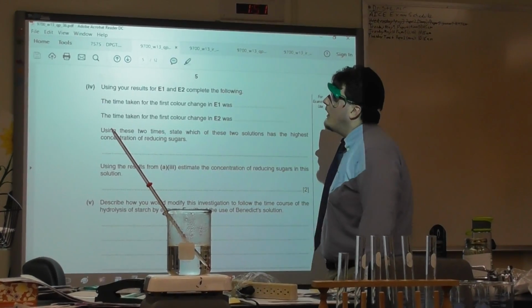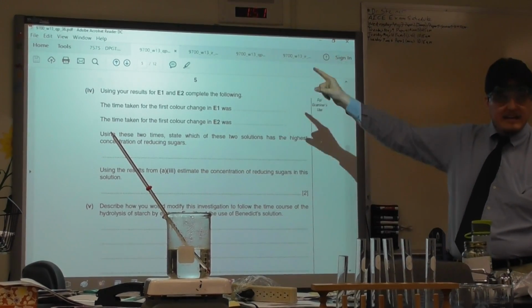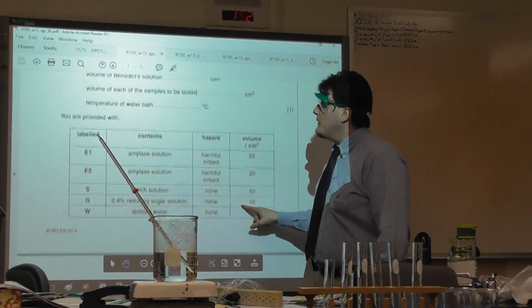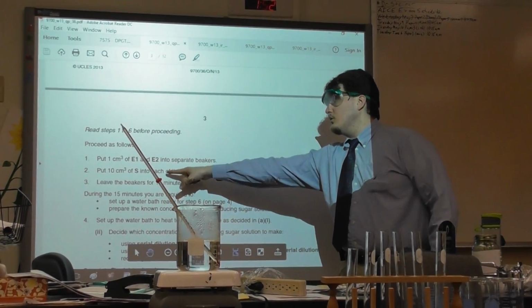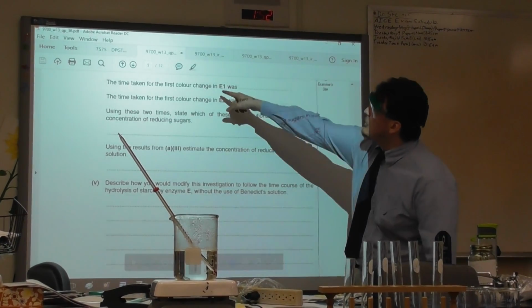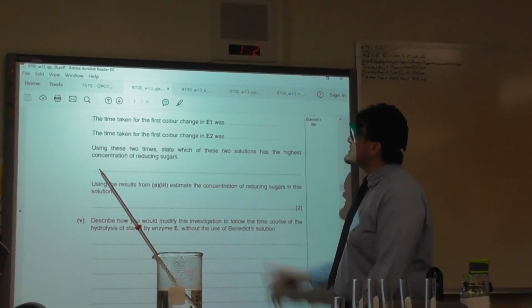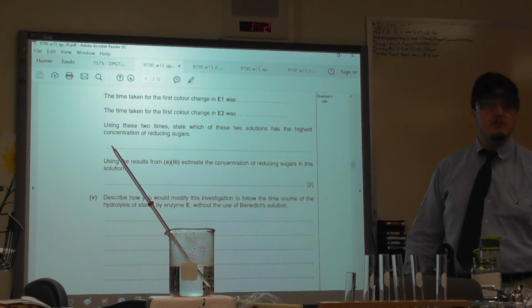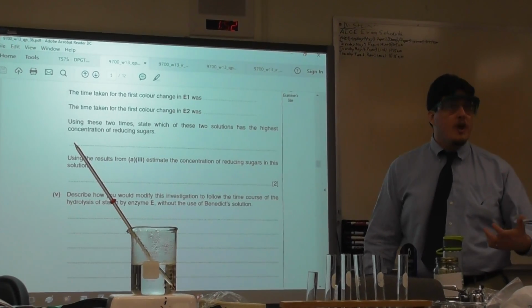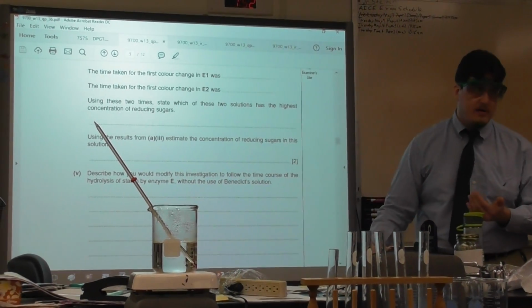Now, in part 4, using my results for E1 and E2, which means I'm going to be testing E1 and E2 plus S, plus that starch, which it told me to do in part 1 and 2. Let's scroll this down. I'm going to record the time taken for the first color change in E1 and E2. And then using these 2 times, I'm going to state which of these 2 solutions has the higher concentration of reducing sugars. Remembering that a higher concentration of reducing sugars will react faster in the Benedict solution test. Faster reaction means lower time.